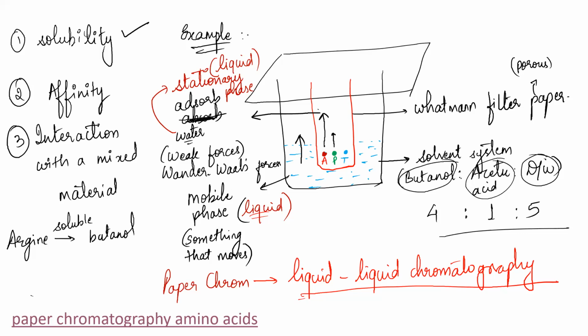In this video, we will show you how to separate and identify unknown amino acid by paper chromatography.